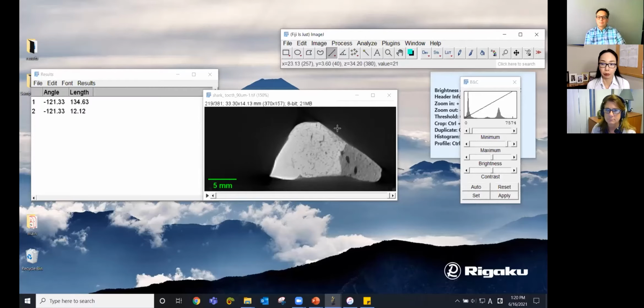Okay. Then the second question, somewhat related, is there's a help that you can see on Fiji at the end of that toolbar. Are there user groups to help with this and so on?